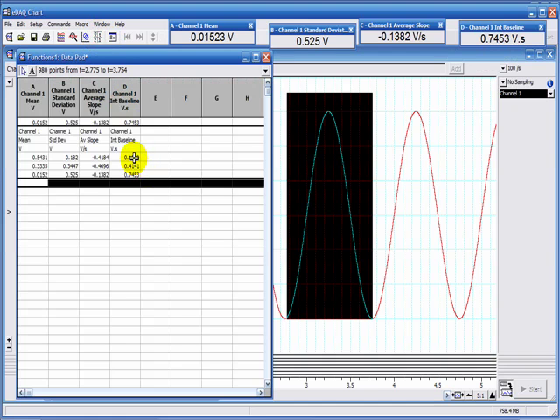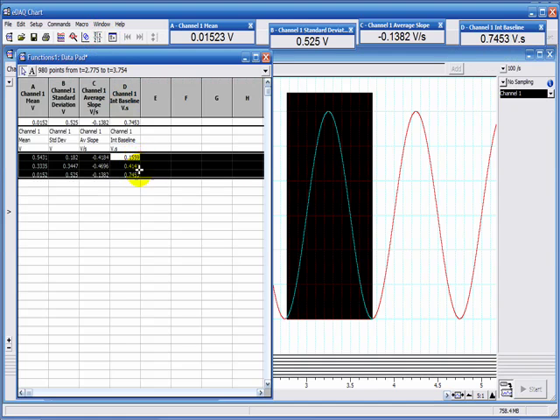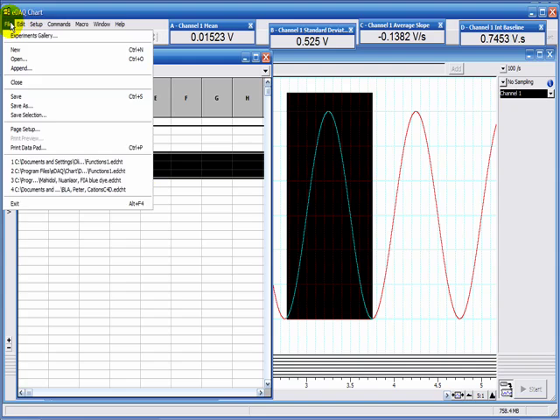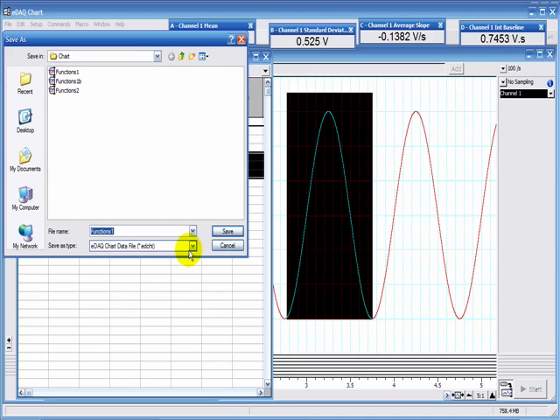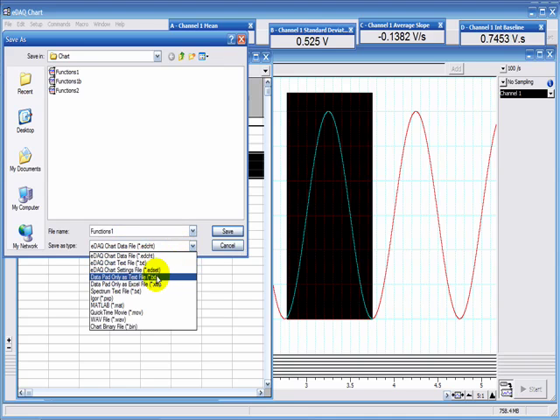And now if I open my data pad again, you can see it's calculated for those three peaks the area in here. This can be simply copied to a spreadsheet like Excel, or in file save as, one of the save as types is saving the data pad as text or directly to an Excel file.